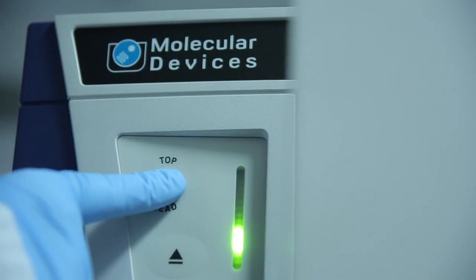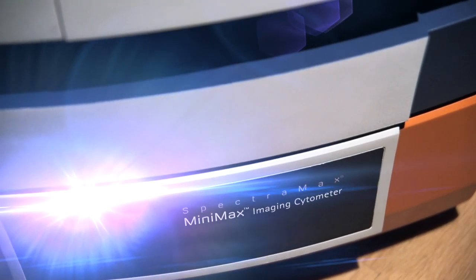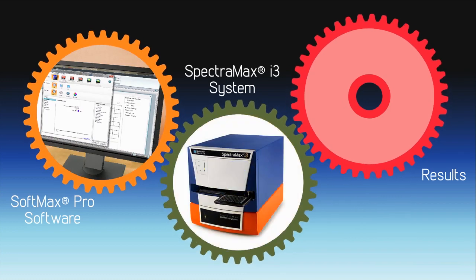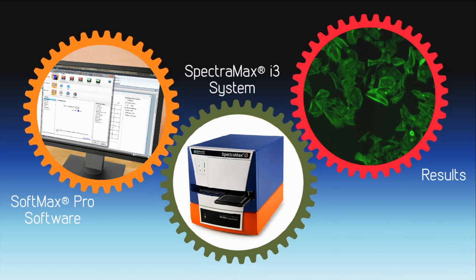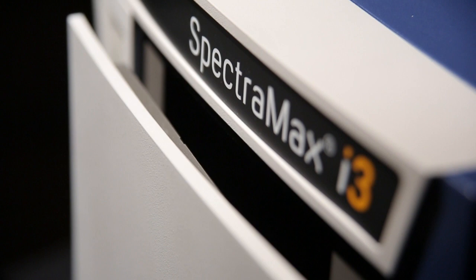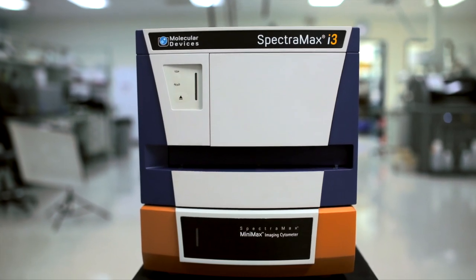The system with all its options, including the SpectraMax MiniMax imaging cytometer, is driven by SoftMax Pro software. Combining over 25 years of continuous development, the new user interface and powerful data analysis package simplify the setup of the SpectraMax i3 platform, getting you to your results much faster.